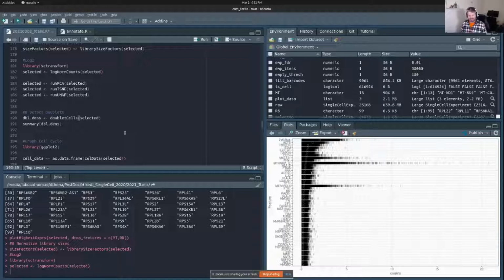Bone marrow contains a lot of different cells. I found it useful. There are other techniques out there, some based on clustering methods. So we talked about those UMAPs and t-SNE clusters, and there are some doublet detection methods that say, hey, this cell's kind of in two clusters, it kind of fits other clusters, and it compares them, like it's probably a doublet, it has features of both clusters. I haven't had a lot of luck. Well, that's a lie. I haven't found that entirely useful for my workflow. But it's something that exists. A lot of people do it. You'll see it in publications.